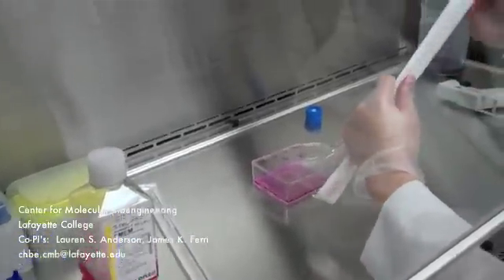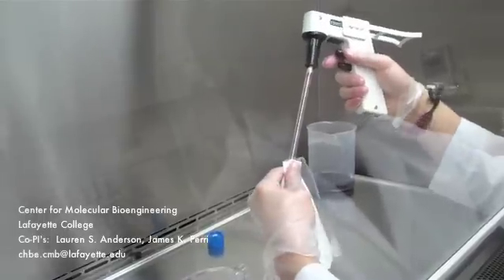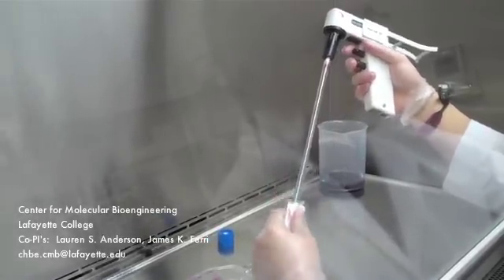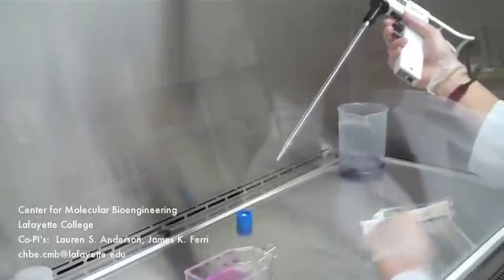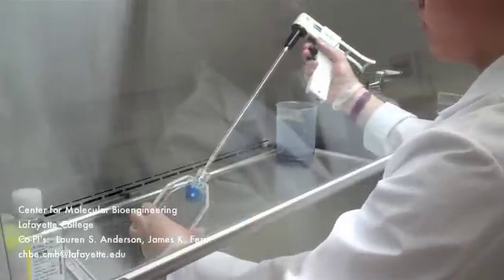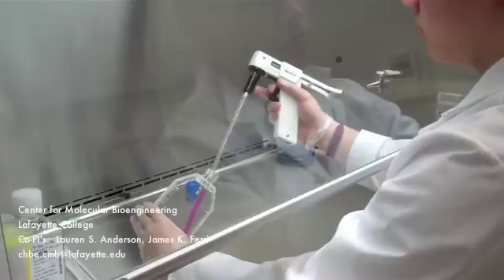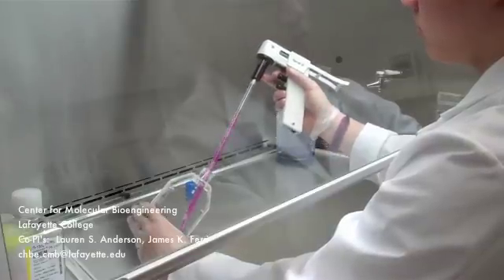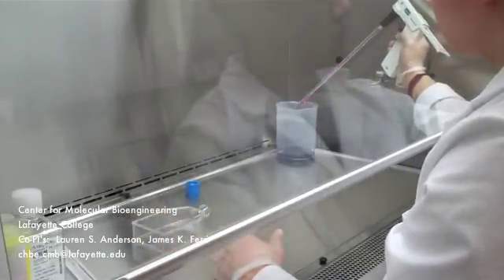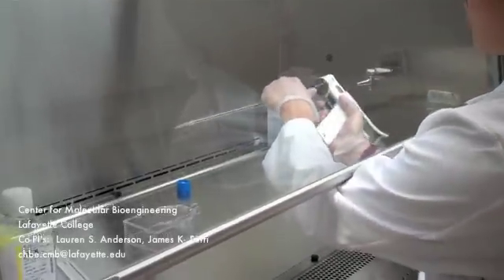Now grab the 10ml pipette, open it half way, and attach it to the pipette gun, adjusting the pipette while it is still in its casing so that you can read the milliliter markings. Remove the wrapping, being extra careful not to touch the tip of the pipette. Carefully place the pipette into the flask, making sure the tip does not come in contact with anything else in the hood. Aspirate all the media using the top button of the pipette gun. Take the pipette out and discard the media in the appropriate waste beaker using the bottom button of the pipette gun. Remove the pipette and place it in the appropriate waste container.